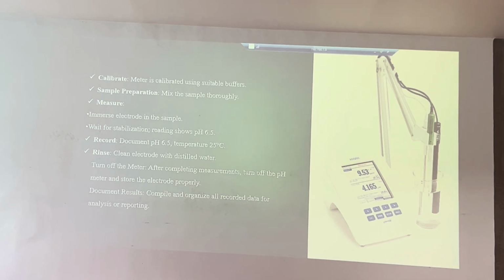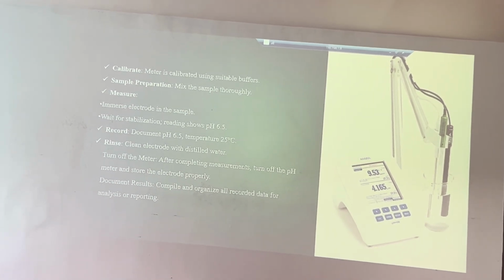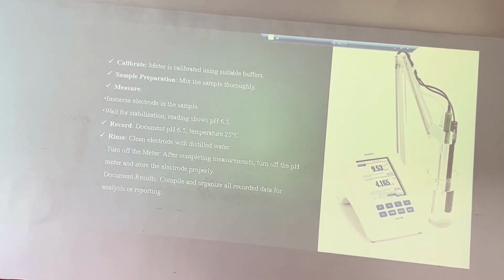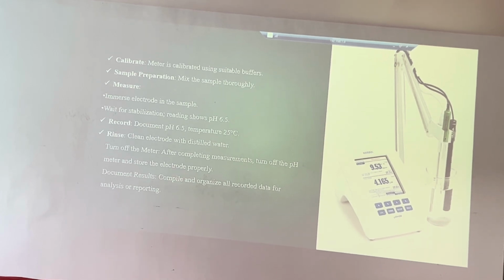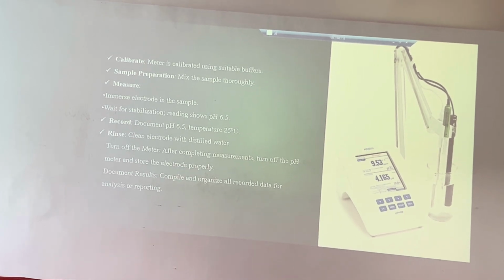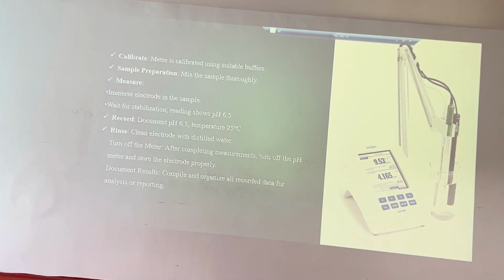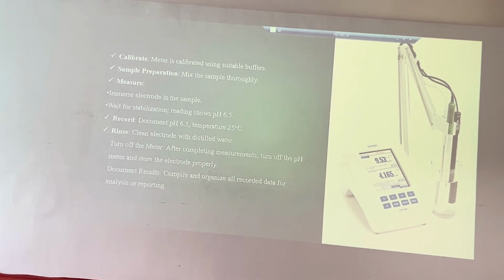For example, pH is temperature sensitive, directly proportional to temperature. I have seen some products where, if it says measure the pH at 20 degrees centigrade, you need to take the pH value at 20 degrees centigrade only.